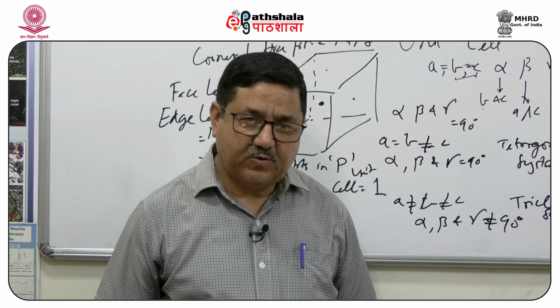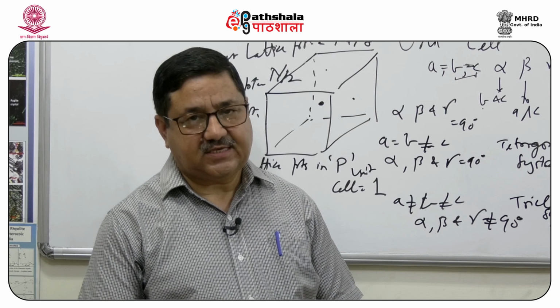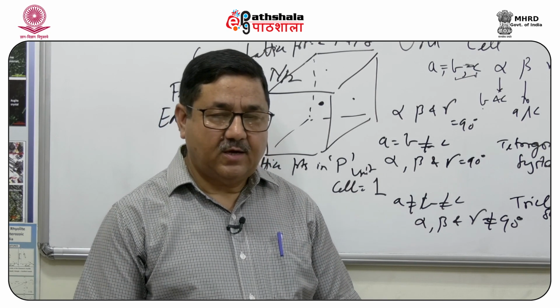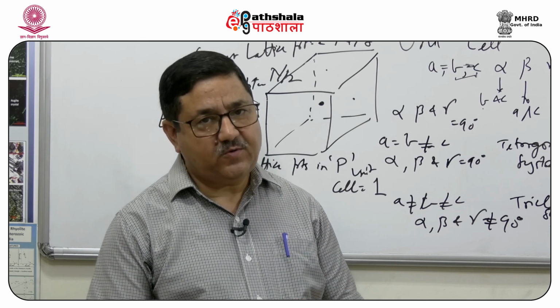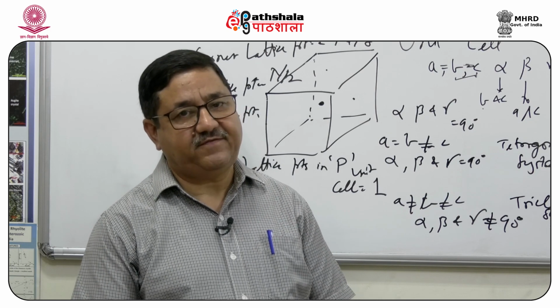So, we have learned today that minerals mostly behave as crystalline substances, and to investigate this nature, which is defined by a small unit or unit cell in their structures, we can use X-ray diffraction.